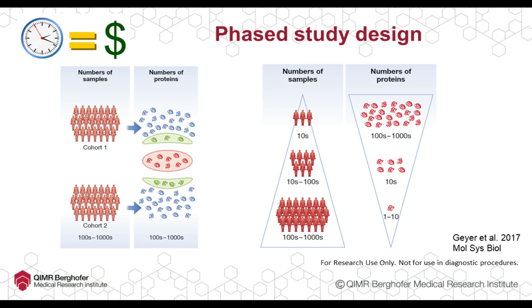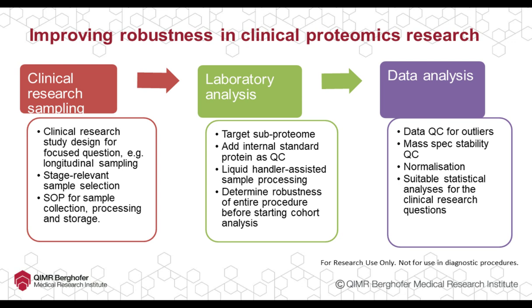So a phased study design is quite feasible in terms of cost and allows different selection and different types of proteomic methods during the steps.